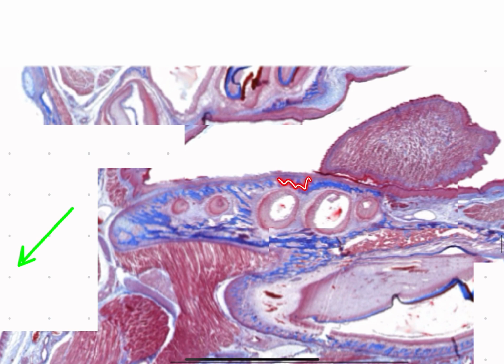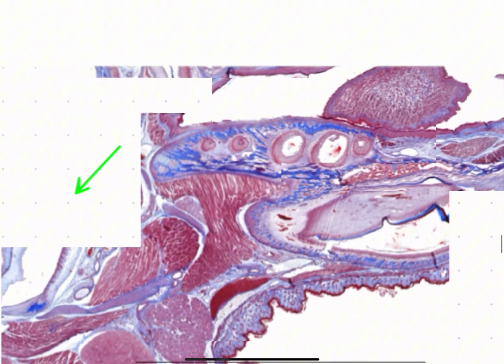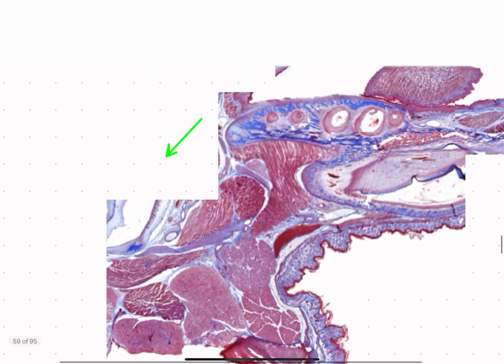And then we also have the blue area. In this case, they use blue dye that helps us find almost bone-like formations. In this case, it would be the bone trabecula, as well as the developing dentin, which is blue too, in slides like these.